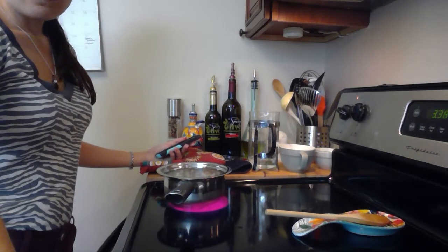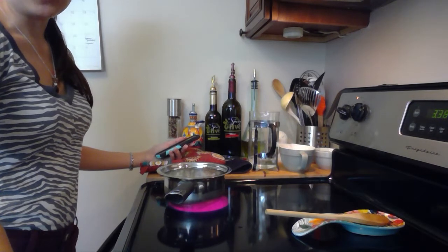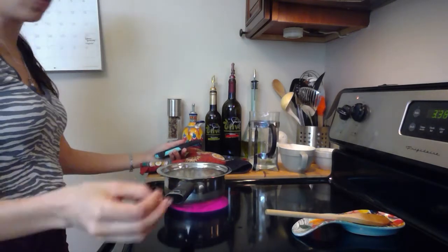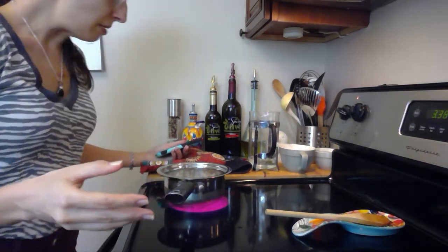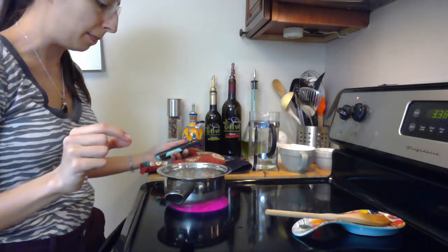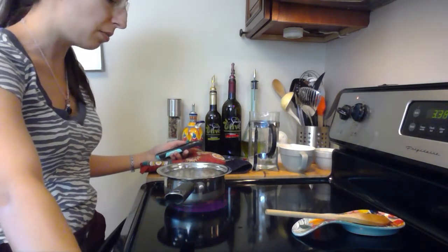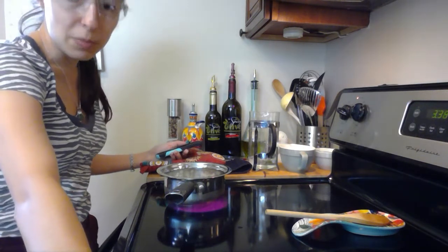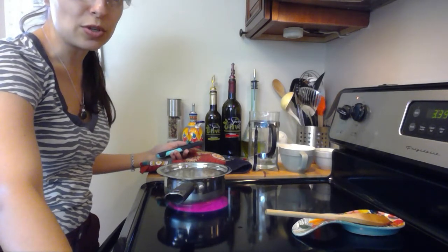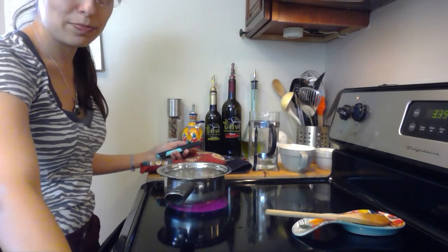Now you're going to record all of these numbers on your chart. And you're going to add some observations as well. So the observations that you want to have in your table are really about the phase that the water is in at that point. So at my first time 0, I'll probably say that it's mostly ice and I have a little bit of water. As you go, maybe you start to notice that it's turning into a lot more water, so that can be your observation. And then you might notice it's completely liquid water. And as you go, maybe then you start to notice some bubbling going on. So whatever you observe, go ahead and put that in your table as well.